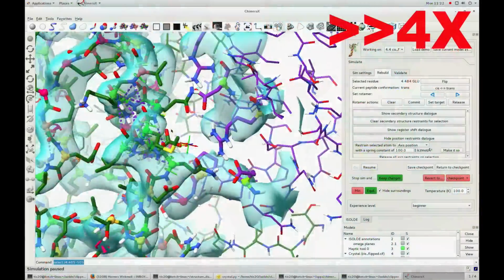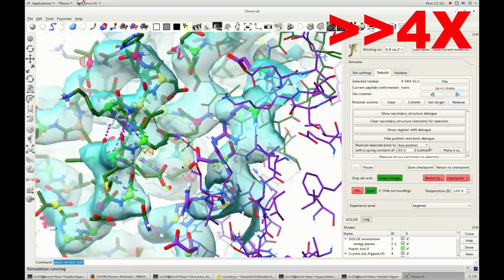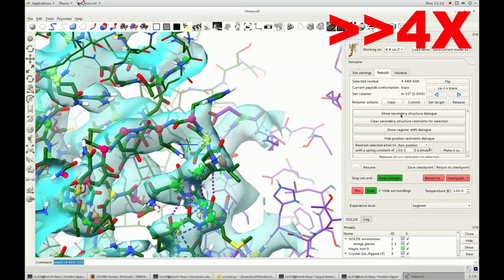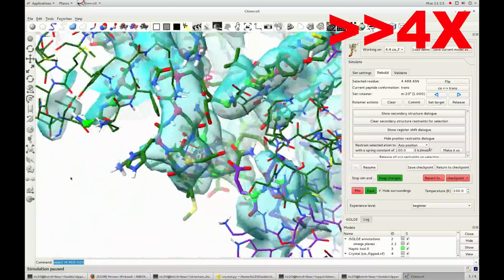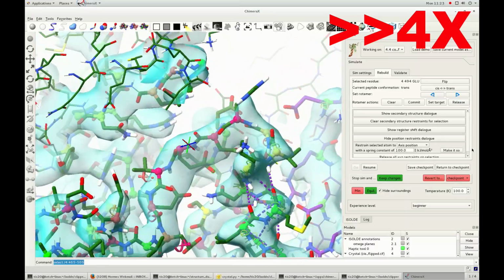There are various ways you can approach the remaining cleanups, but that's really a matter of personal preference and the available computational power. One, the approach I took in this case, is to use the Ramachandran plot, tackling one outlier at a time. This may seem like a daunting task, but keep in mind that in the act of solving one, you'll often end up solving another half a dozen nearby, so it's not as big a job as it might first seem.